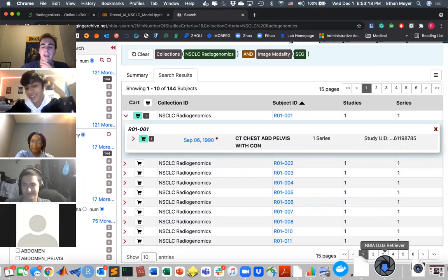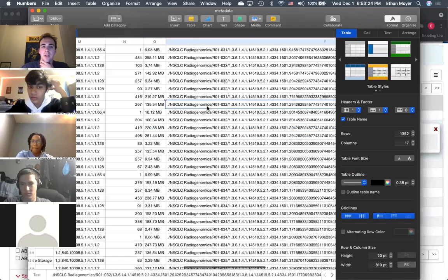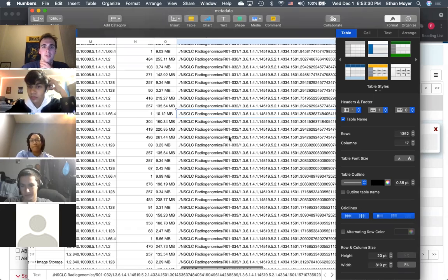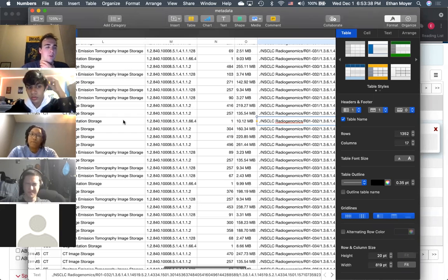Oh, you know what probably happened? The directories look exactly the same as the normal directories. You just have to use this CSV file. The directories aren't different. They look similar, but you have to use a CSV file to do it.